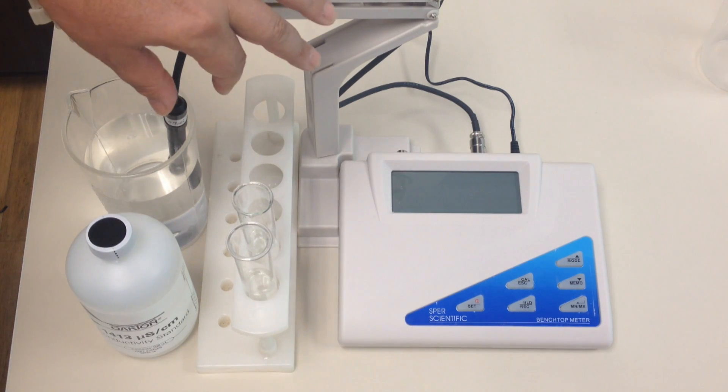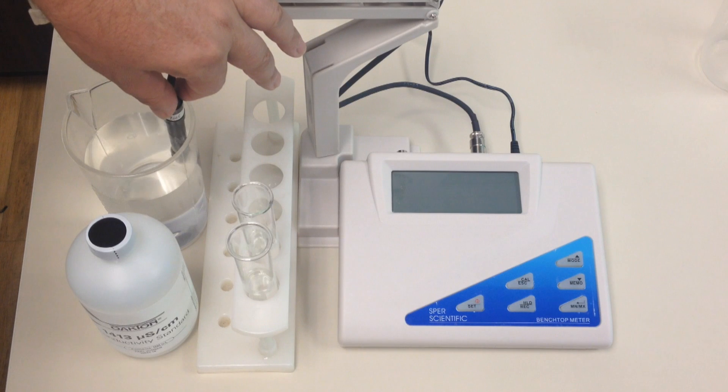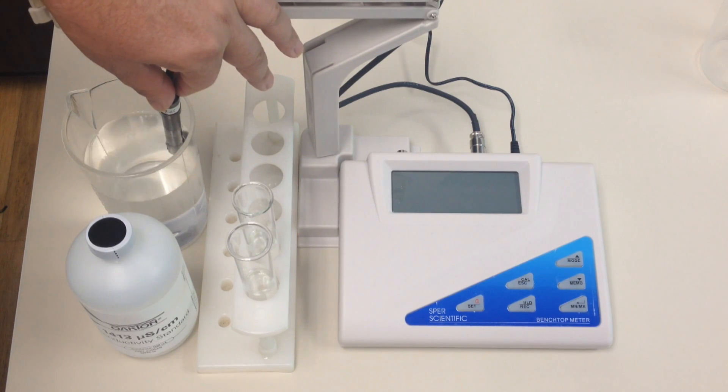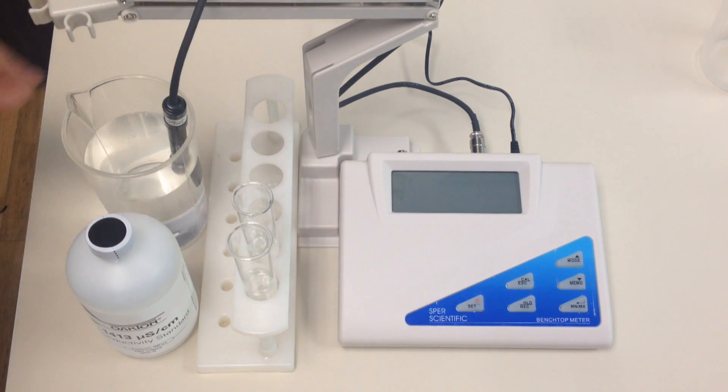So the first thing you do after you get the unit, or if you haven't used the unit in a while, is make sure it sits in distilled water for at least 30 minutes. Now our probe has been sitting in distilled water for at least 30 minutes. Also, every time you calibrate the unit, you must use fresh solution.